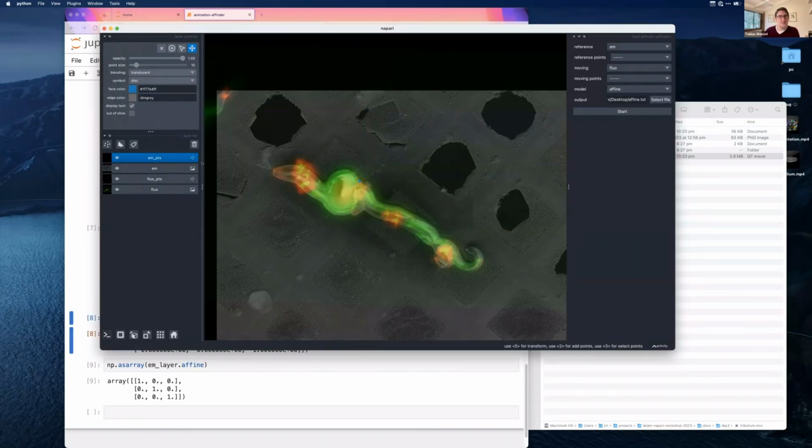Very nice. Thank you very much for showing us these two very helpful tools. I think I haven't used them yet, and I think it gives very nice results to use them. Also, the animation to explain things in talks or share it on social media.